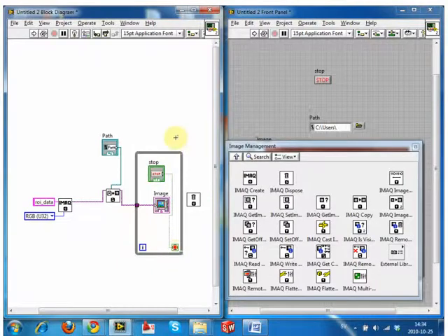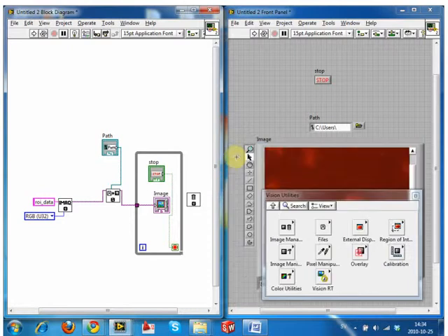Okay, so now at least this will stop when we hit stop, but the downside is this loop will run as fast as your computer can do it. In other words, it'll probably action it 1,000 times per second. Around about a millisecond it takes to run these loops. So we need to put a time delay in there because we're putting this in to wait for our action. We need to draw a region of interest on the image and we need it to wait for our input. So we don't want it running that fast because we don't work faster than 30 frames per second, so we don't need this loop running faster than 30 frames per second.